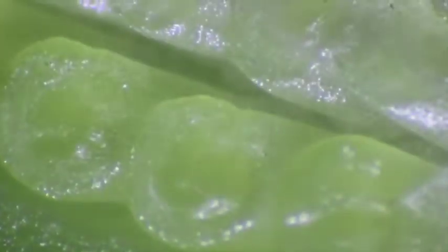That's about as close as I can get to the ovules, how steady my hand is, that stuff. So those are the ovules. It's a nice close-up view of the ovules in my hands. Not steady enough to get really any closer, but that's as close as we get. So those are the ovules.